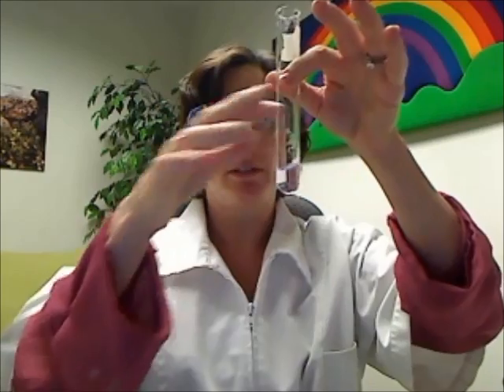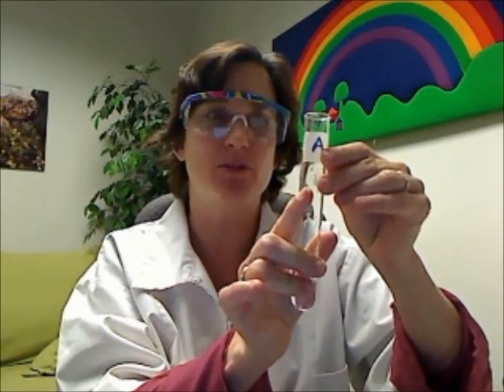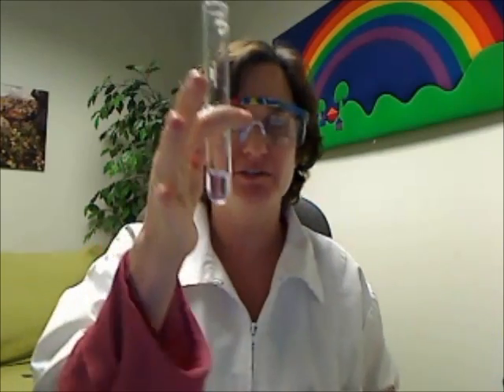What do you think about this one? Soluble or insoluble? It may be difficult for you to see on the camera, but all of the powder has disappeared, and therefore this one is soluble. Now, I should tell you, this is not A. I just labeled this A arbitrarily, so I haven't done A for you. You're going to have to do all of them. There we go. It's still an unknown.